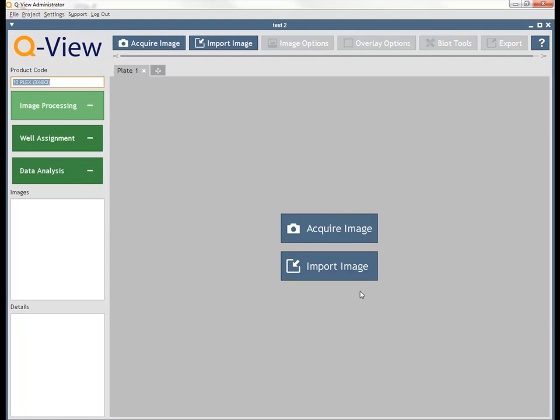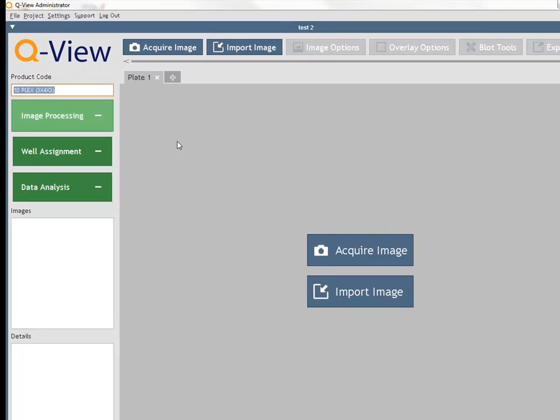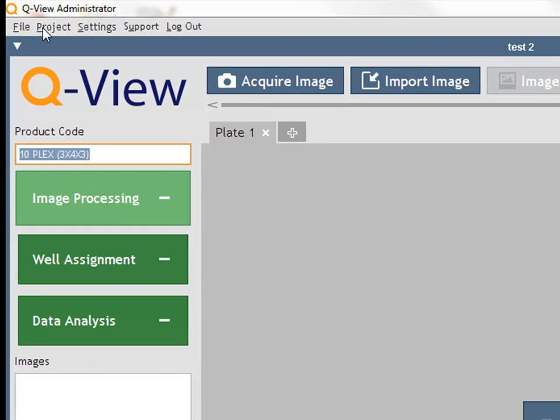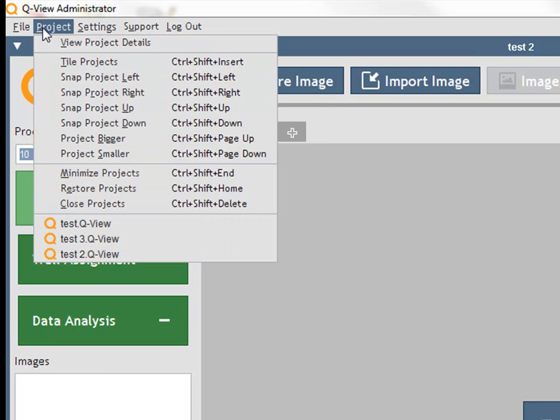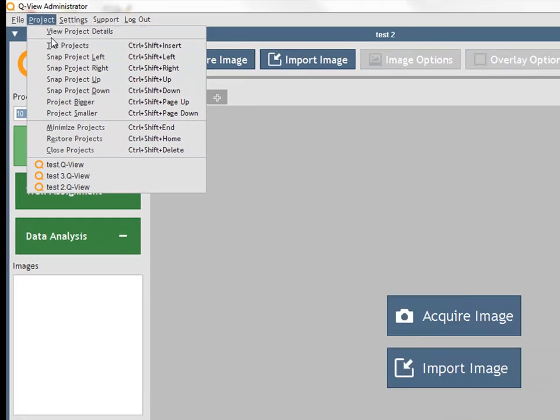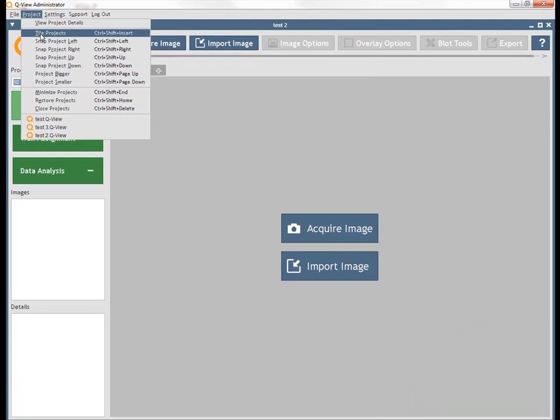You can open and manage multiple projects at the same time. Use the options in the Projects menu to tile, select, and position your projects.